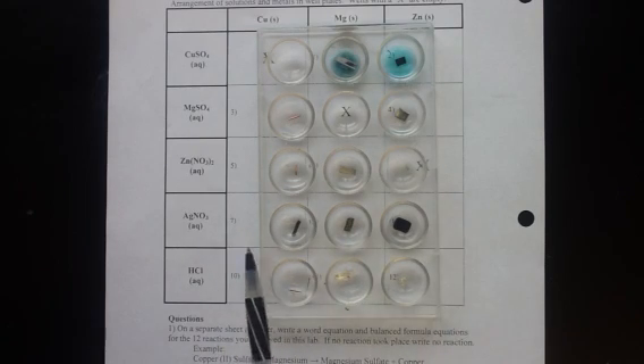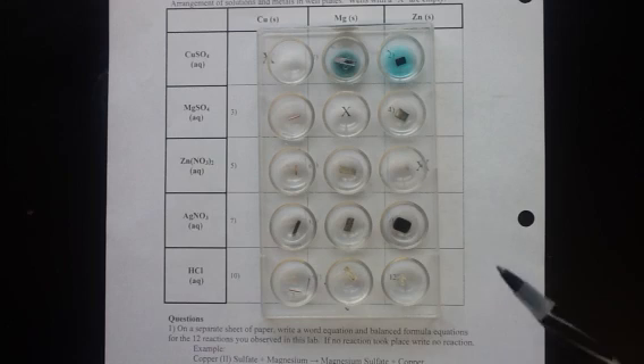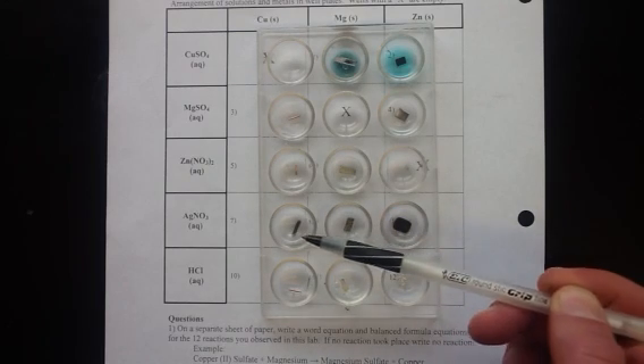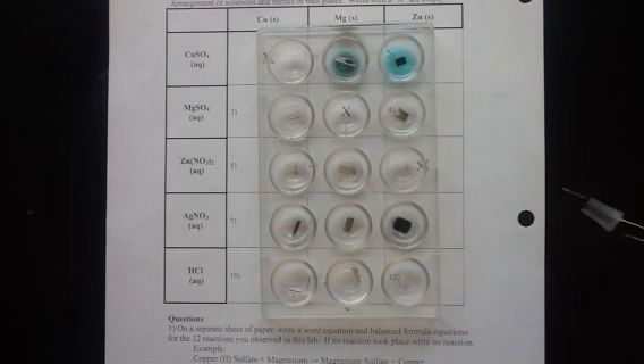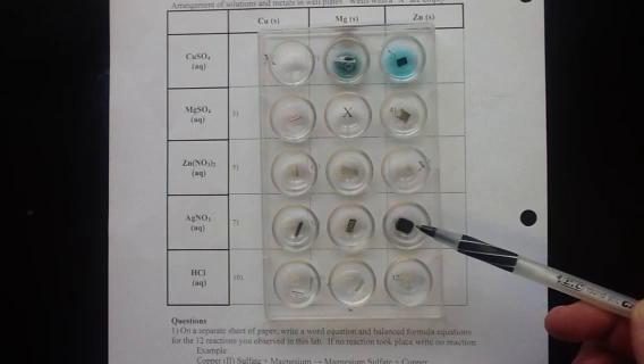In this row with the silver nitrate we can see they're starting to form a blackish-gray coating on the copper metal, also forming on the magnesium and zinc metals as well. That's silver metal that's actually coming out of the solution. The metal that was present - the copper, the magnesium, or the zinc - is actually going into the solution. So we have single replacement reactions taking place in these three wells.